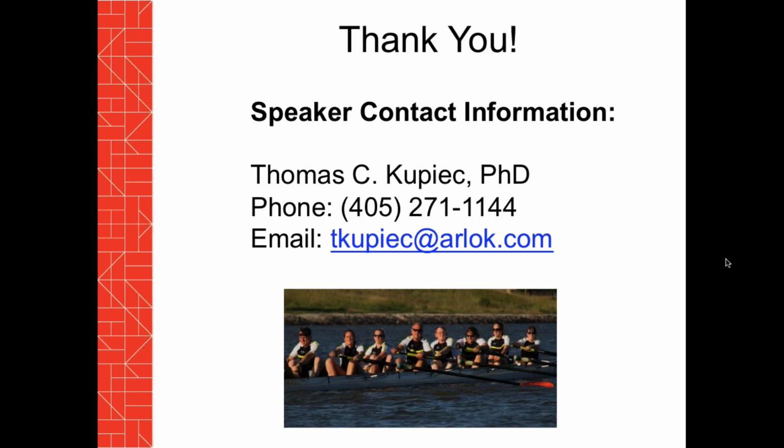That's going to actually depend more on what their requirements are. So it's probably going to be a case where the supplier may or may not supply that information to you. But as a good practice for your own business, you're going to definitely want to perform that testing on your own, whether they do or don't, to confirm the data.